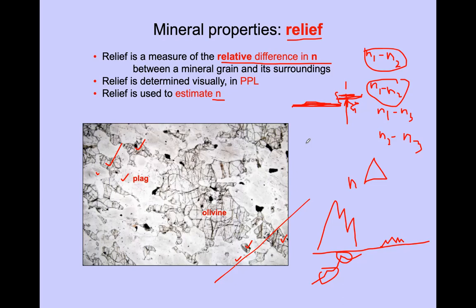So it should be almost identical to the glass, right? Even though you applied it on the glass, you might not see a difference. It should look like glass, even though you applied a layer, right? Therefore, this special glue is manufactured in such a way that it has the same refractive index as the glass, right? 1.5.